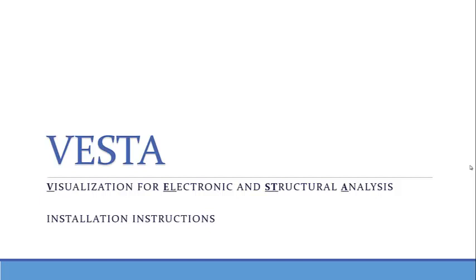Hello and welcome. In this short lecture you'll learn more about VESTA. VESTA is an acronym for the visualization for electronic and structural analysis. What you'll see is that it's a great tool to help students visualize a lot of crystal structures and also compounds.